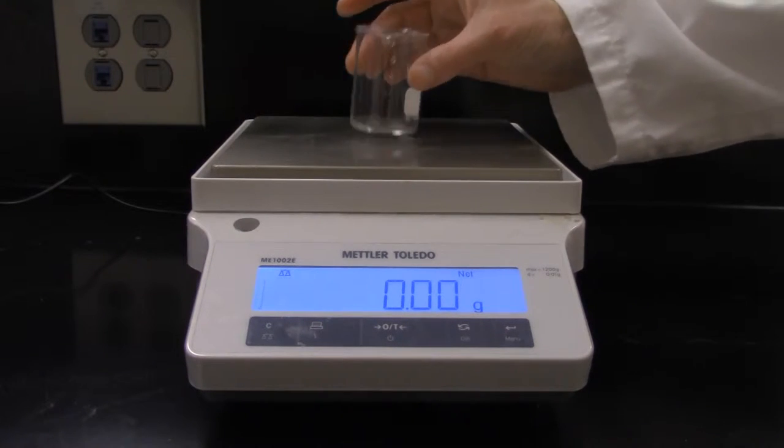If you want to measure the mass of a liquid, then what you can do is push the zero button again with the beaker in place, remove the beaker, pour the water into the beaker, and place it back on the balance. Now you have the mass of the water in the beaker. You should never pour liquids into a beaker while it's on a balance.